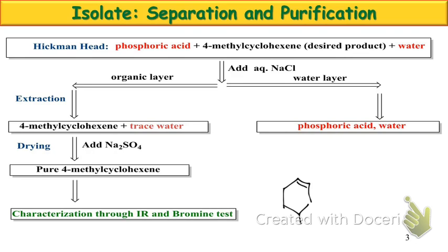London dispersion forces. What does water have? Hydrogen bonding. Would we expect those two to mix? No. So we could expect to see two layers form immediately from our reaction mixture. But due to the presence of heat and the slowness of the distillation process, we end up forming an emulsification, or said more simply, salad dressing. The water and your organic product completely mix, and we end up with a very cloudy solution, or you might end up with a cloudy solution.